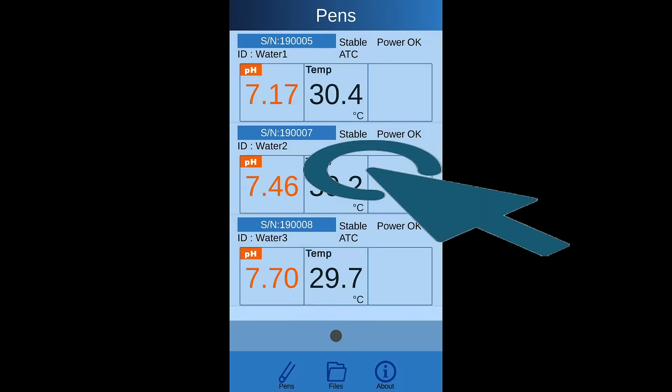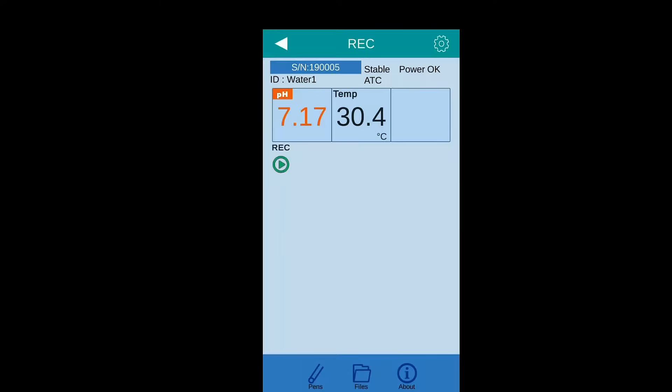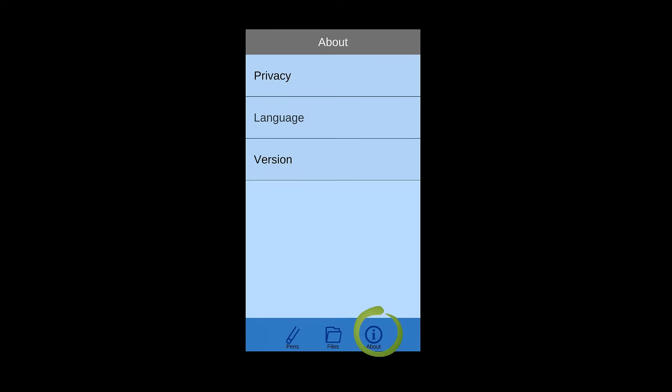Click the column to see detail information of each device. Furthermore, you may choose different app language under about page.